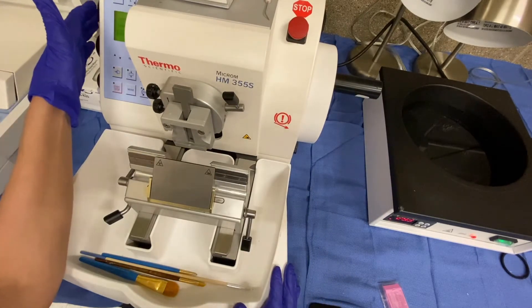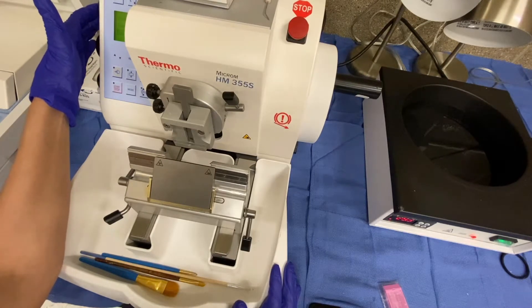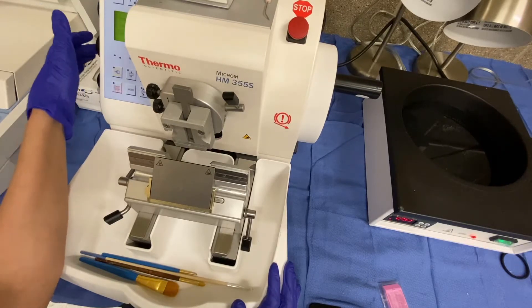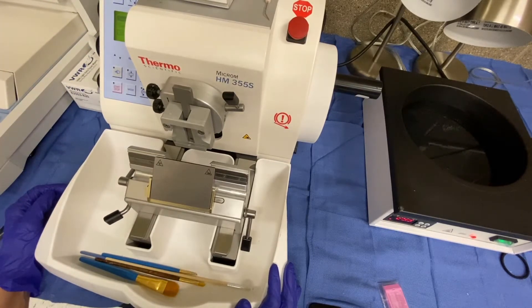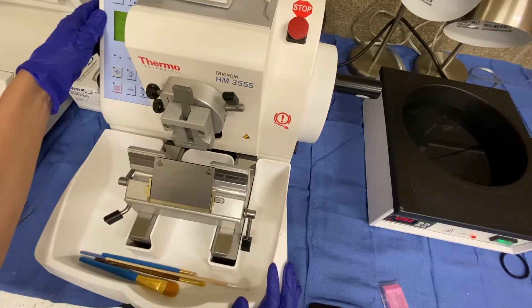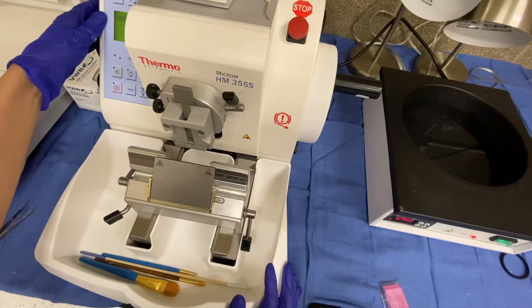Over on the left-hand side here, at the top, you can see I am tapping a button. What this button does is switch between the trim feature, which is when you're facing the block, and the feed feature, which is when you're actually taking your section. Those are the main two settings you'll switch between. When you first start facing your block, you'll start on trim, which in this case is 20 microns. Then feed, when you're actually taking your ribbon, will be on four microns.